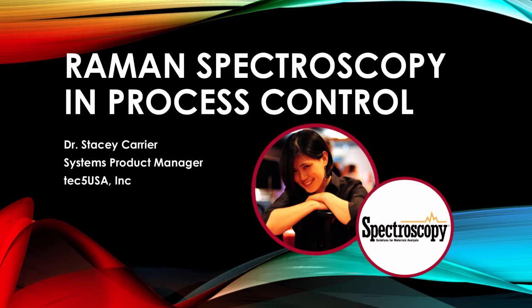Okay. With all of these hurdles, what are some of the advantages of Raman technology? Some of the advantages of Raman spectroscopy, I'm actually going to compare in two or three lumps to make it a little bit simpler.